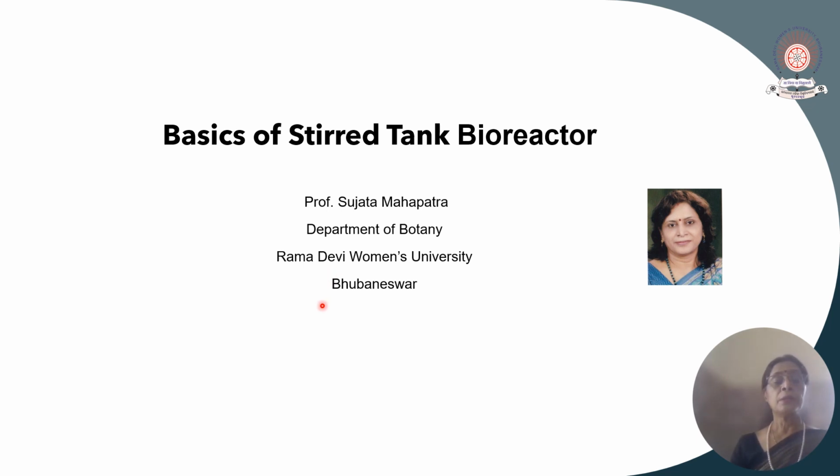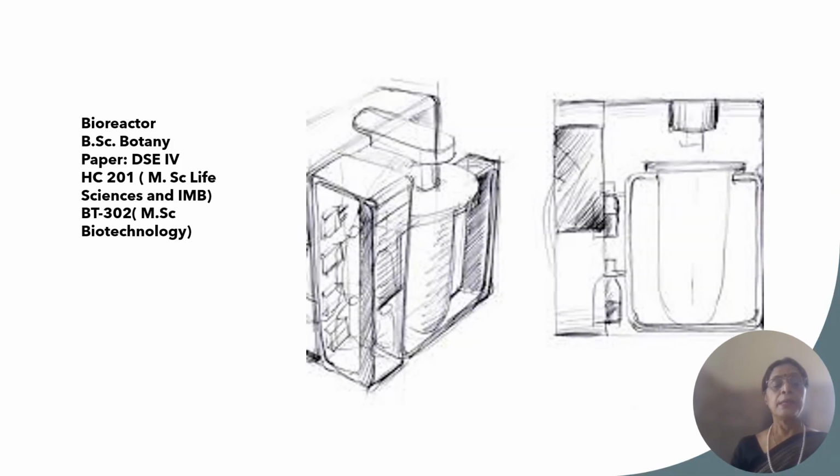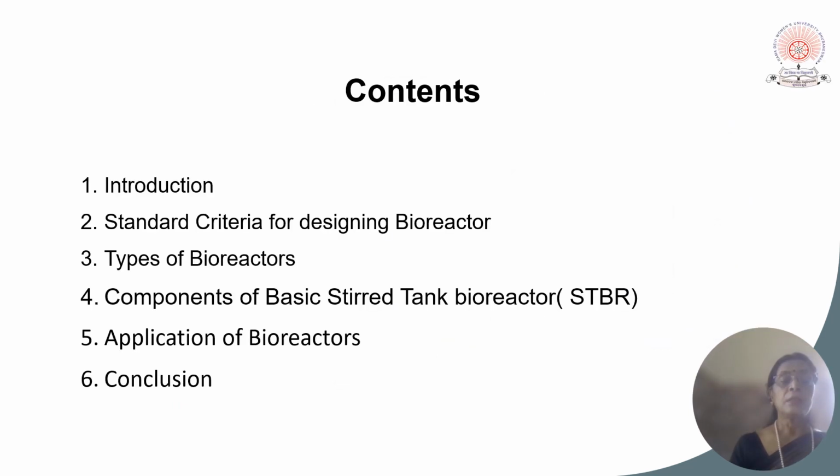In this video lecture, I shall be discussing the basics of a stir tank bioreactor. It is a part of the course curriculum in BSc Botany, MSc Life Sciences, MSc Industrial Microbiology, and MSc Biotechnology courses. These are the contents of this video lecture: introduction, standard criteria for designing the bioreactor, types of bioreactors, components of a basic stir tank bioreactor, application of bioreactors, and conclusion.